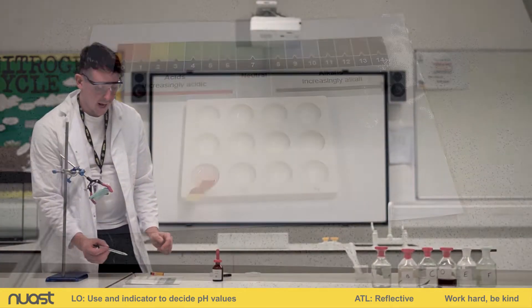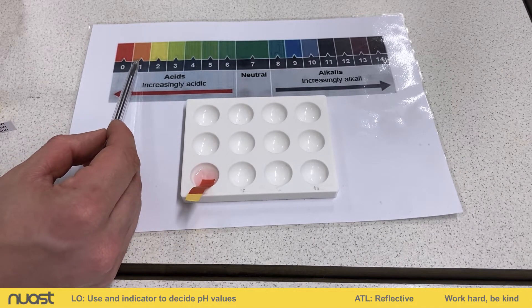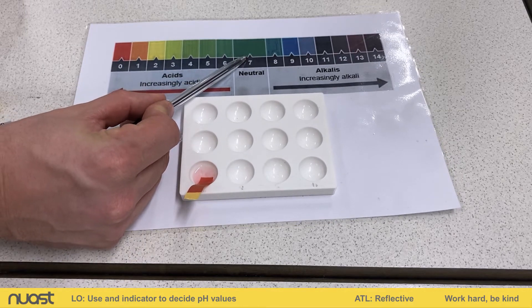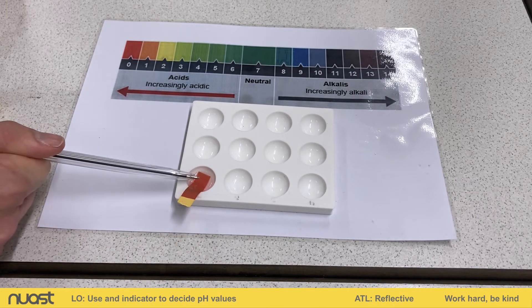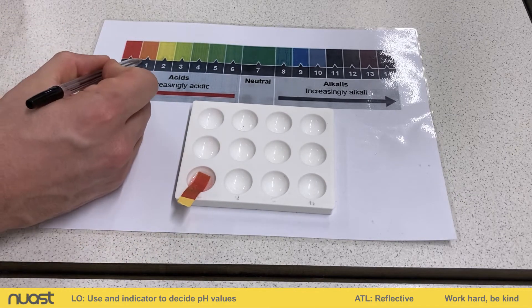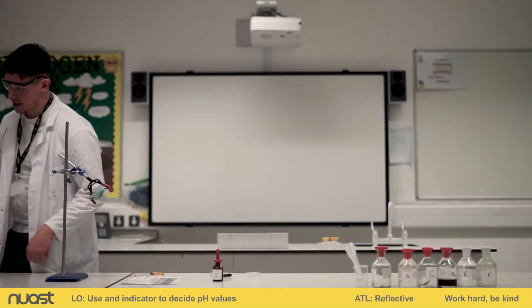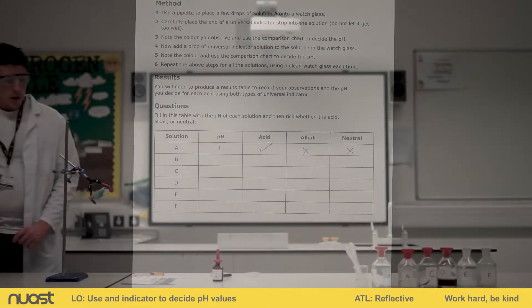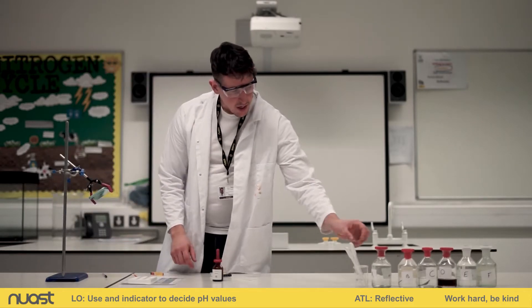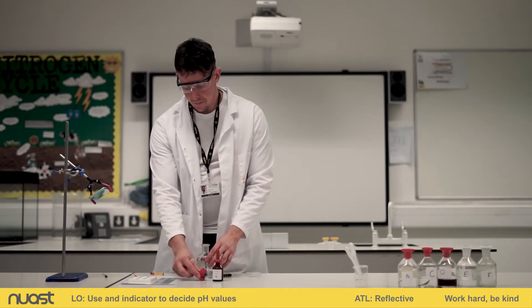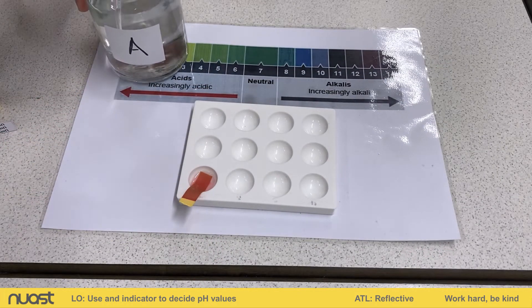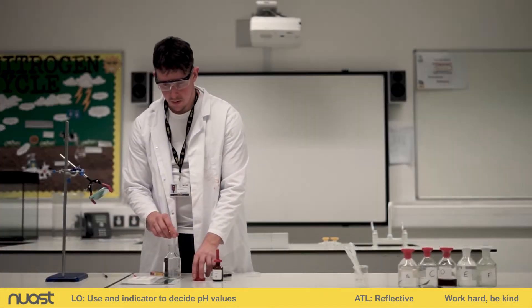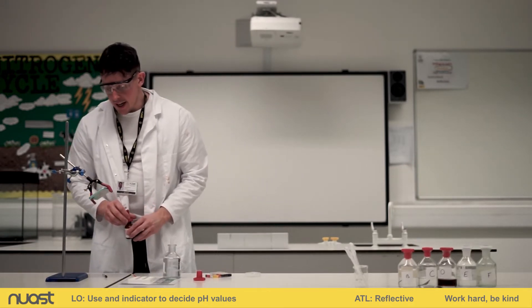We can then identify how strong the acid is. Looking at the scale, we've got orange, red, yellow and gradual colours until we get to neutral, which would be green. Our universal indicator paper is showing this as orangey-red, so somewhere between zero and one. I'm going to suggest this is a pH of one. We're now going to use the same solution but this time using universal indicator solution.